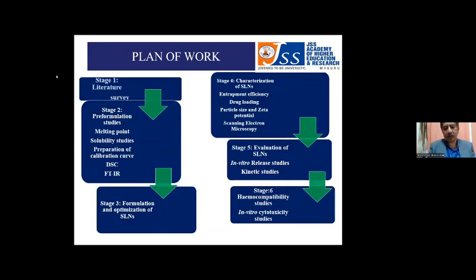The plan of work was carried out in 6 stages. In stage 1, we carried out a detailed literature survey on nanostructured lipid carriers and suitable drug candidates for incorporation into the NLC. This is followed by the pre-formulation studies, in which we carried out melting point analysis and solubility analysis of the selected drug, Atazanavir, preparation of a calibration curve, and compatibility studies using differential scanning calorimetry and FTIR.